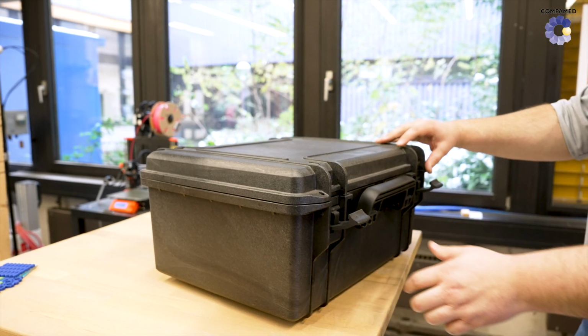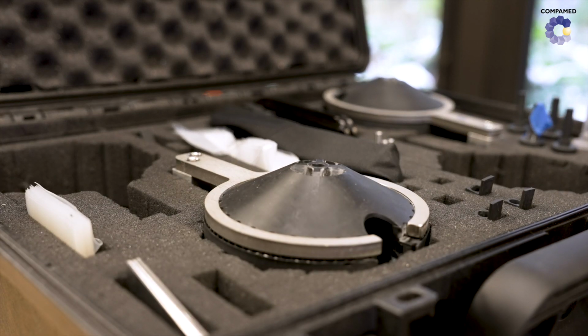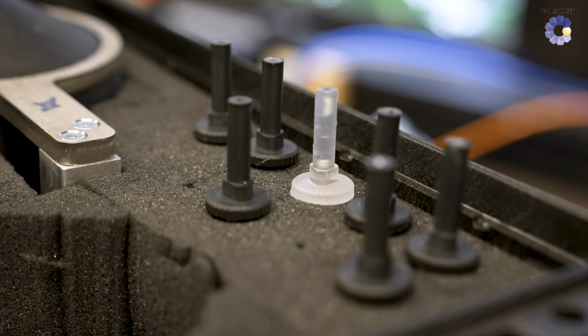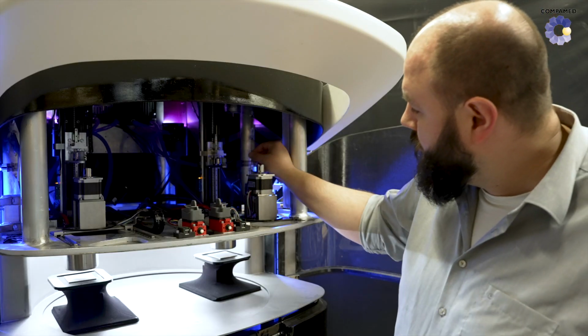Conventional 3D printers are not suitable for processing active ingredients. However, the engineers at Cologne were able to solve this problem. For the pharmaceutical 3D printer, it simply has to be ensured that the complete system is in a residue-free condition afterwards, so that the process can be restarted.